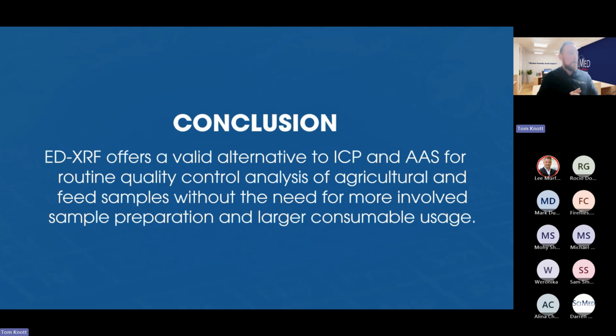So I think we're doing okay for time, but what I wanted to conclude is, hopefully what I've given you is a little bit of flavor for how XRF could offer a viable alternative to other recognized techniques, giving a lot of advantages in terms of throughput, eliminating a lot of the complex sample prep, being non-destructive, but of course not without its limitations. And a key one to highlight, in terms of linking into what Darren is going to mention, is we're not getting information on things like the proteins, the molecular makeup, speciation of certain elements. XRF is very rigid: I'm looking for these elements and it's total element concentration that I'm reporting.